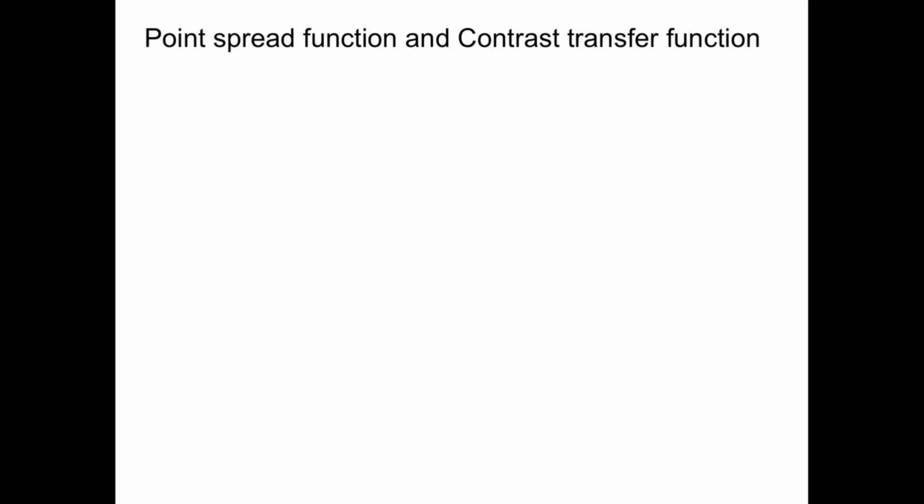Okay, so I want to talk about the point spread function and the contrast transfer function.